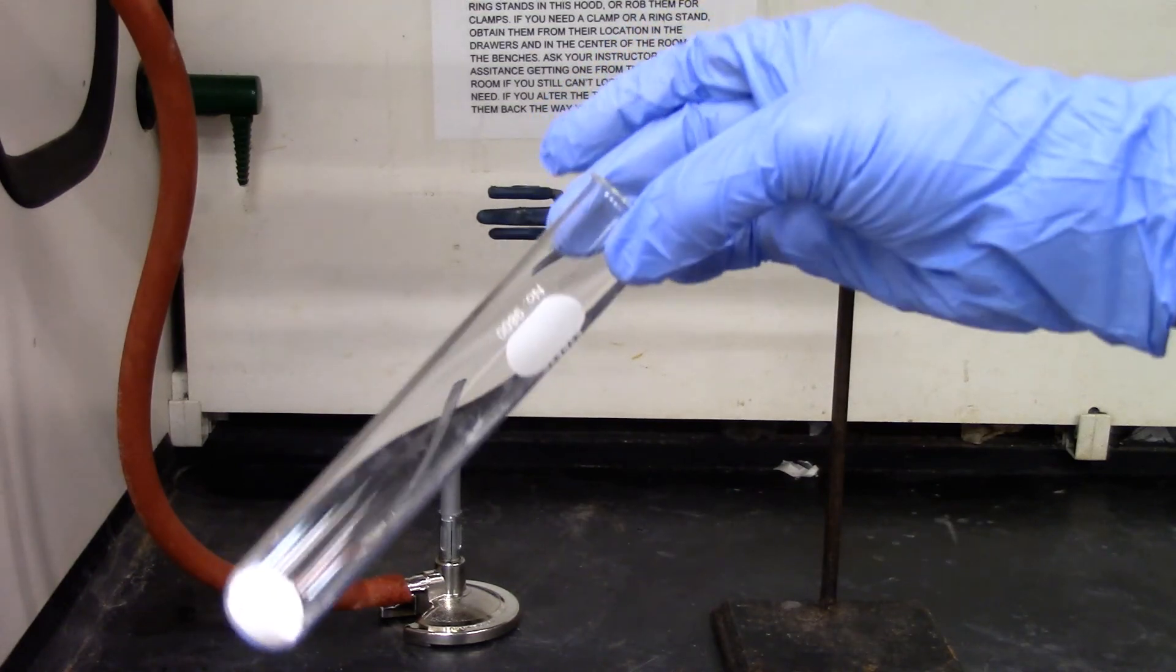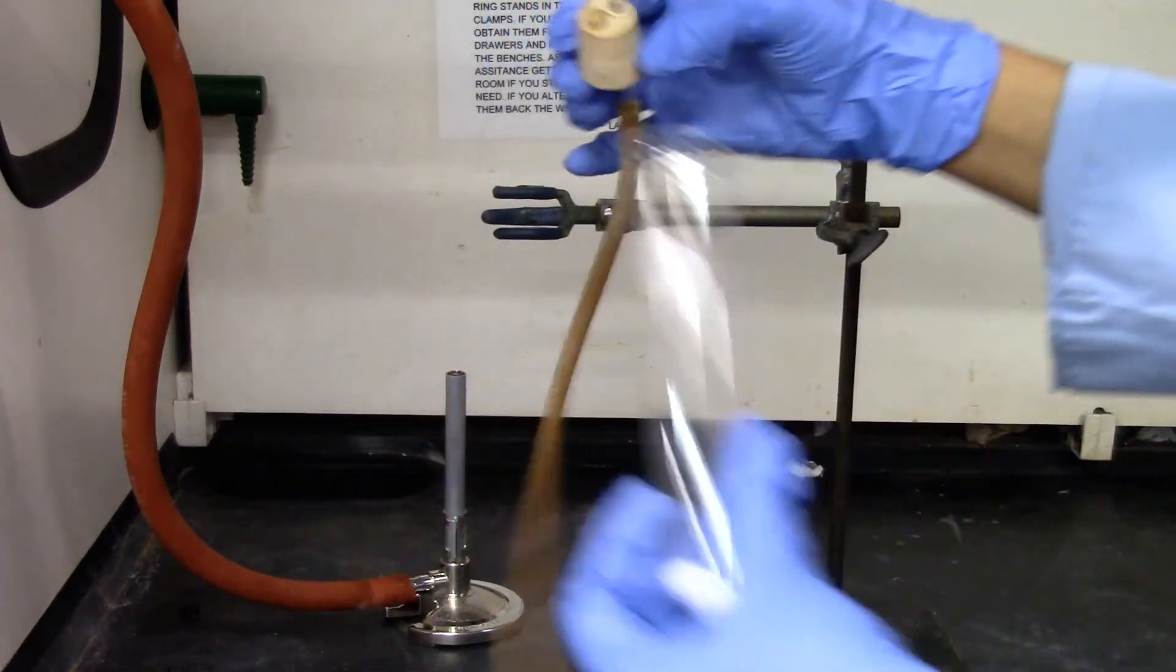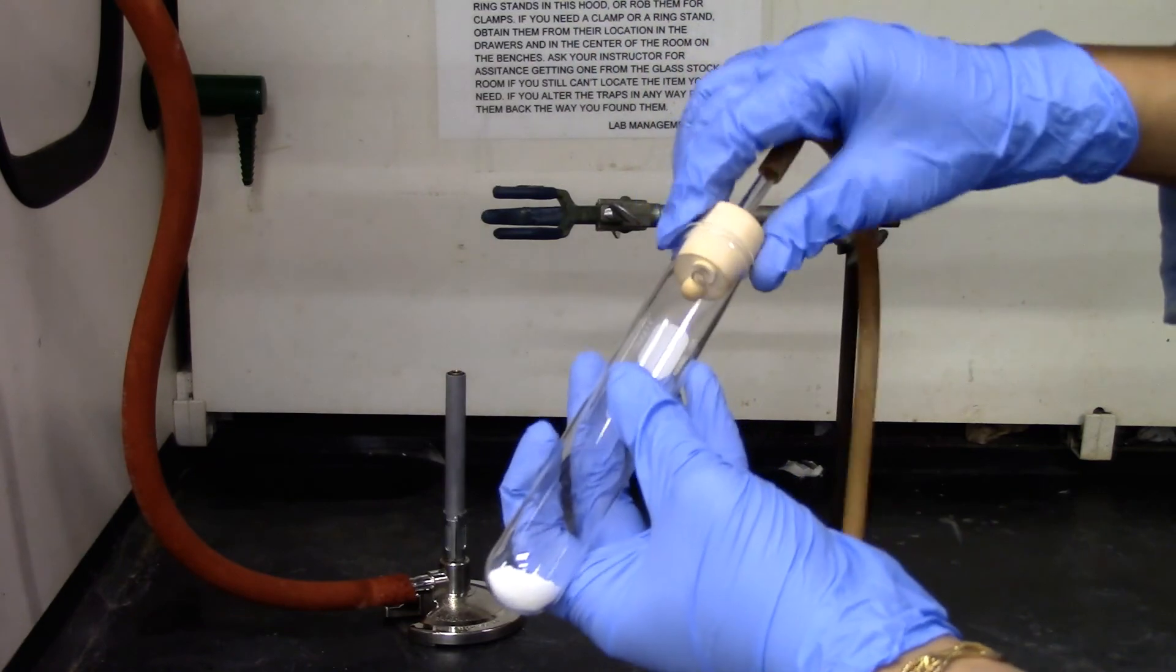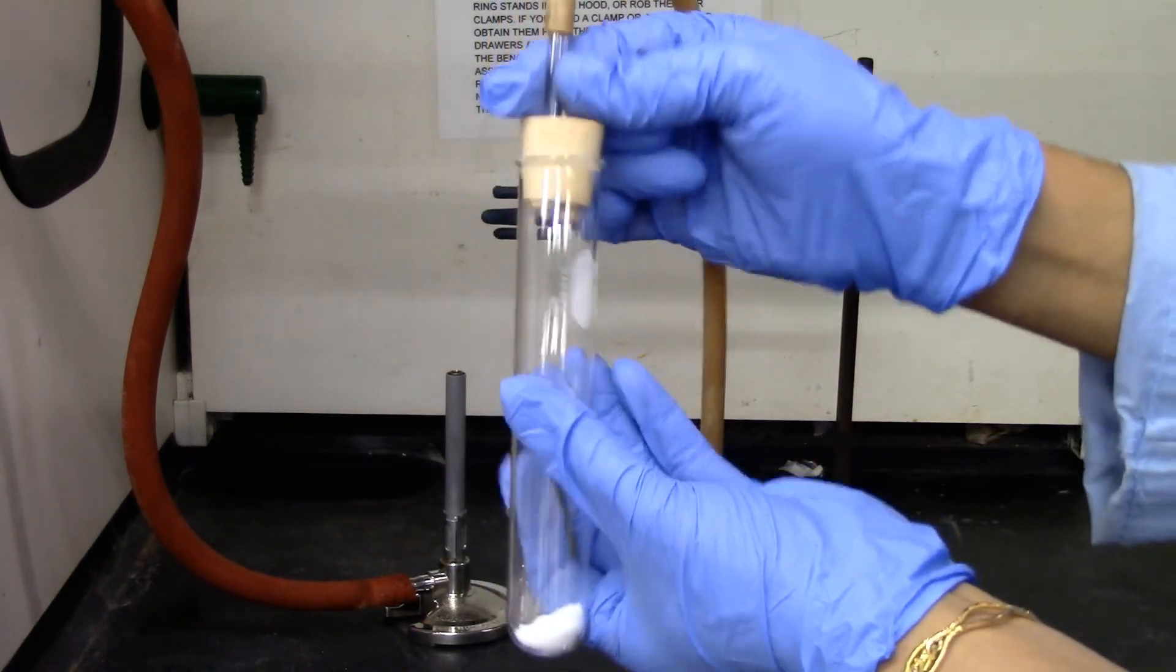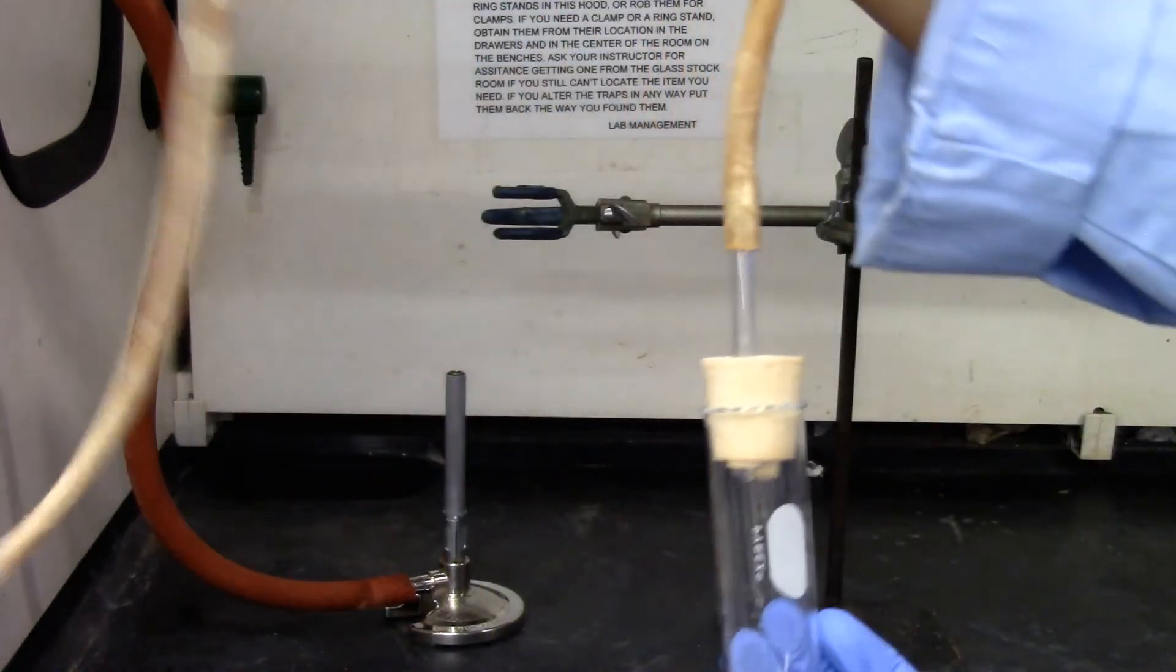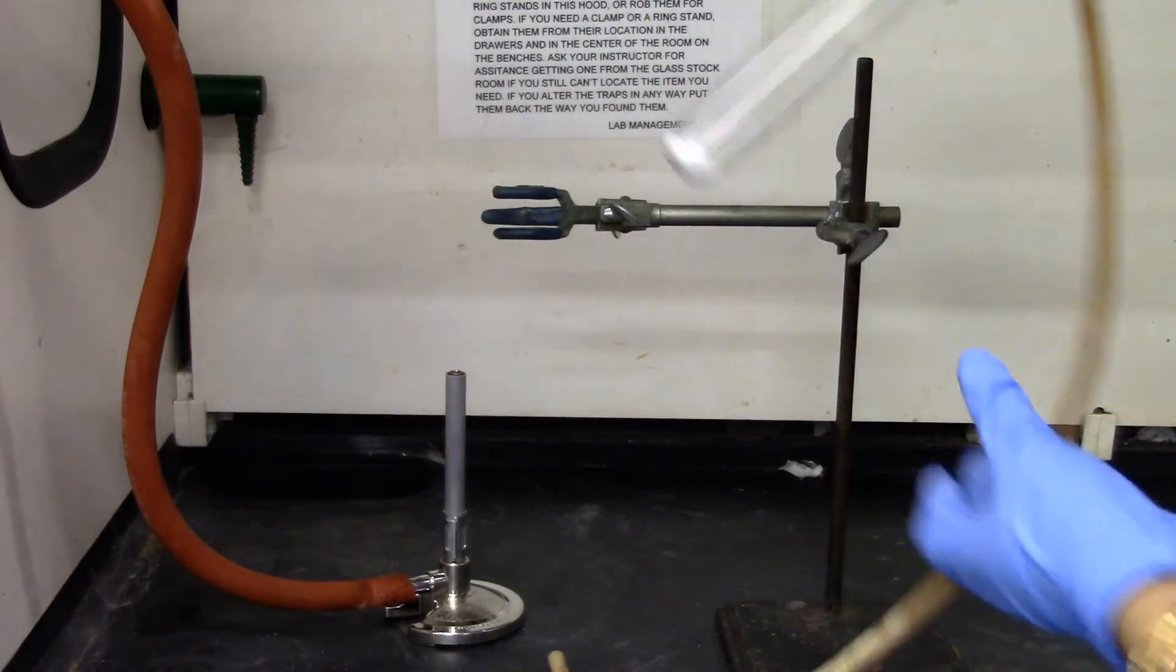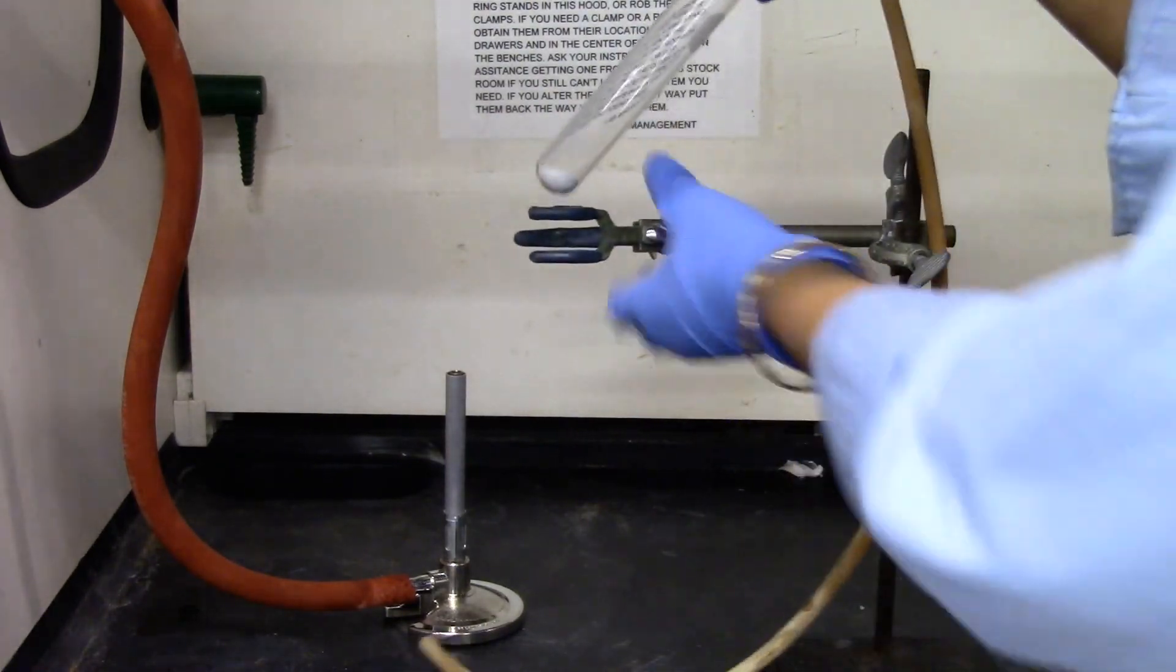So this is my test tube with the baking soda. I'm going to attach a rubber stopper with a glass insert and connect it with the tubing, and I'm going to clamp it on the ring stand.